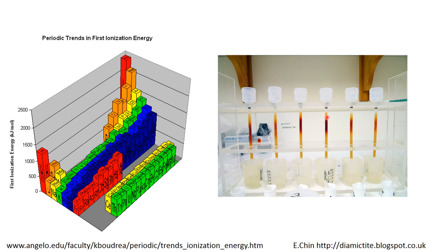I think this is an example of separating out titanium, and you can see that the titanium is caught in the sample in this region, then all the other elements will be washed out at the bottom, so we don't need them, and then we can change the acid to something else that washes the titanium off. So we use this to isolate the element we're interested in before we then dry it down to a very, very small drop to put onto our thermal filament to be ionized and go into the mass spectrometer.